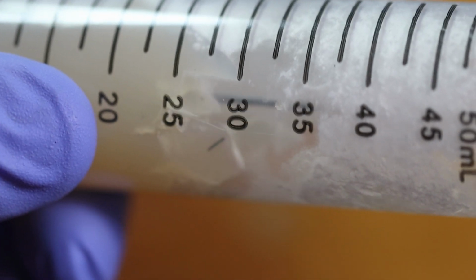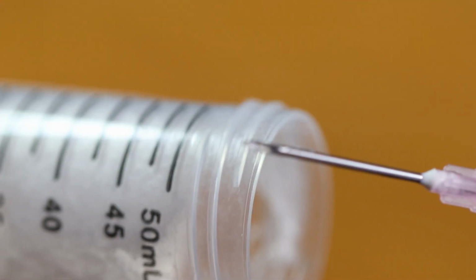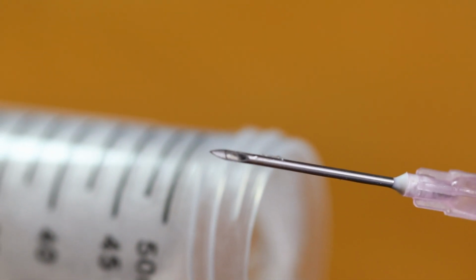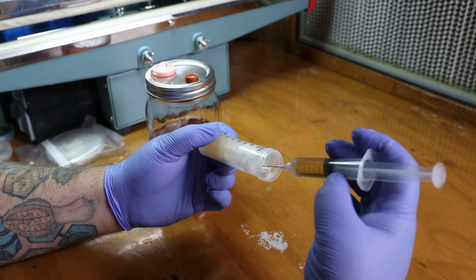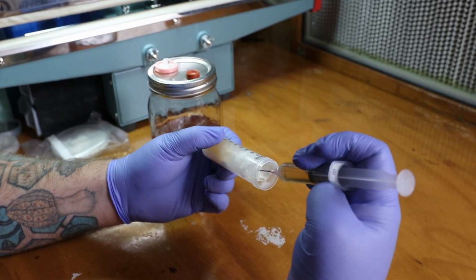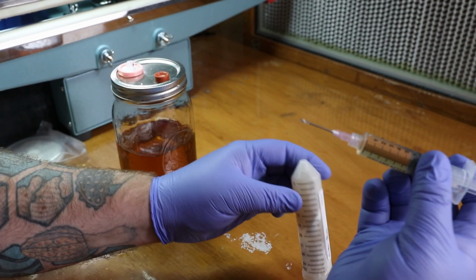We're then going to rotate the needle to pull it out. This helps break the suction. And you'll see here that we've got a biopsy in there. It's clear, a little hard to see, but you can see the line in there. I'm then going to take the needle, clean off the little bits of mycelium I've got there, and then I'm going to set the agar slant back down.